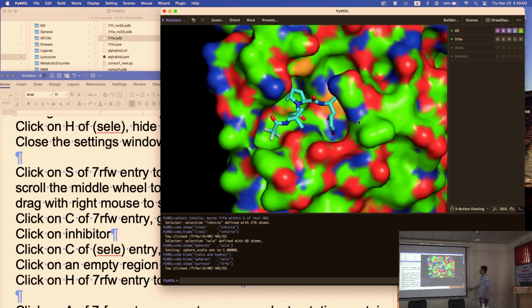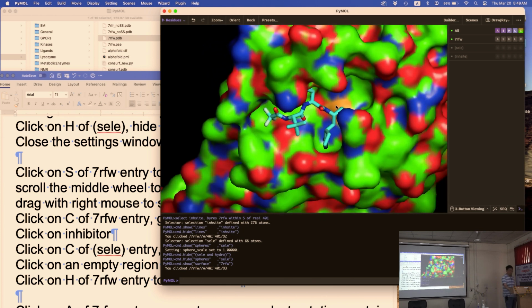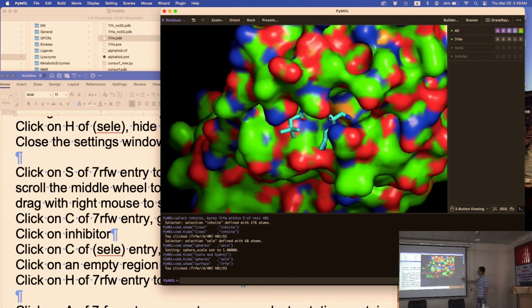So essentially, because this is a protease, the compound mimics the substrate of the protease. So this is how the protease recognizes the substrate, by using these binding sites. Pockets on the surface of the enzyme. And then the cysteine is hiding behind here. That's why we don't see it, but then by rotating around, you'll see it right here. See right here, the yellow is the sulfur. The compound goes into the yellow because that's the covalent bond. Right? So all of this information is there if you know what to look for.